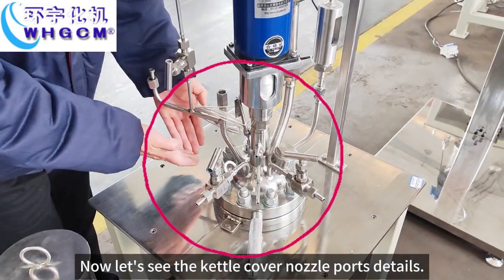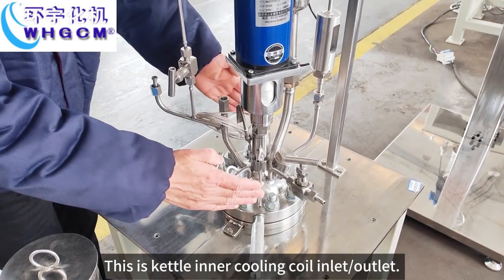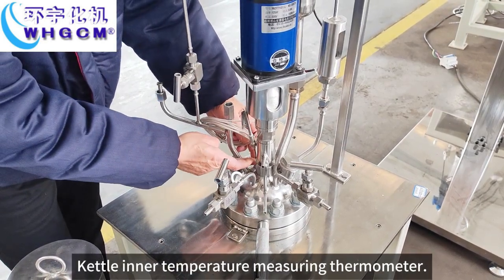Now let's see the kettle cover nozzle ports details. This is kettle inner cooling coil inlet outlet. Kettle inner temperature measuring thermometer.